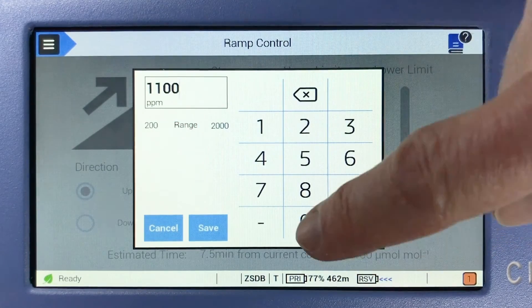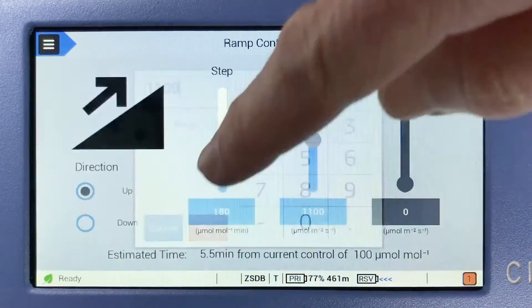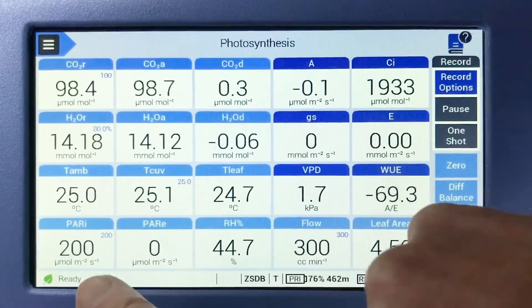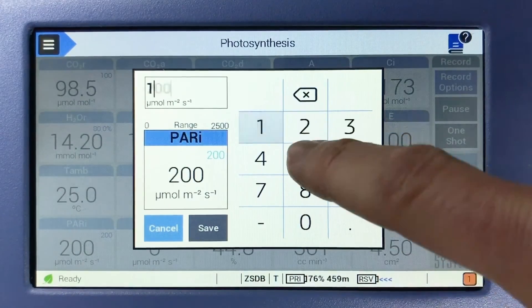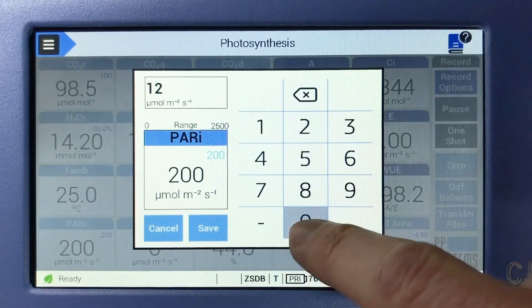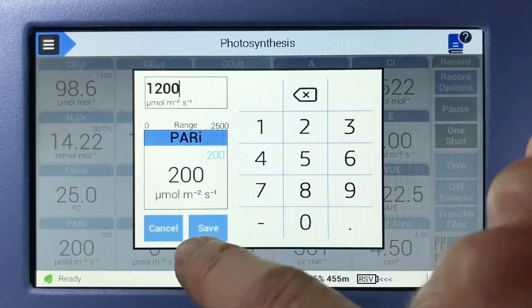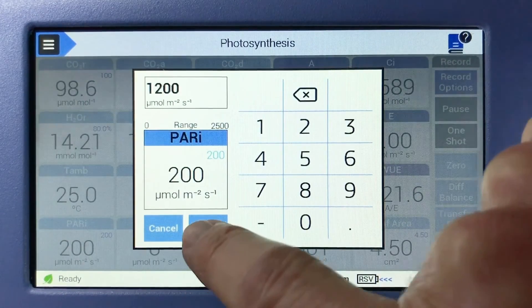Next, let's set PAR. In this example, we're working with Basel, which requires PAR to be 1,200 micromoles per meter square per second.